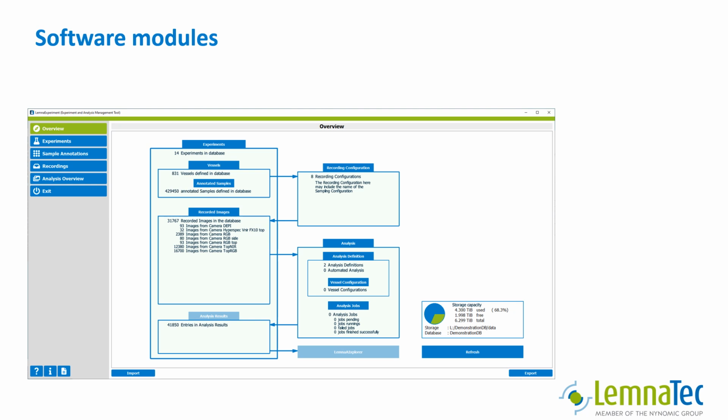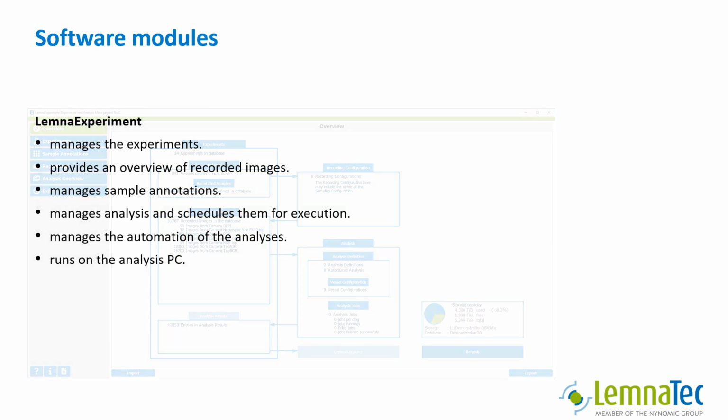Next is Lemna Experiment. Lemna Experiment manages the experiments, provides an overview of recorded images, manages the sample annotations, manages the analysis and schedules them for execution, and manages the automation of the analyses. Lemna Experiment runs on the analysis PC.